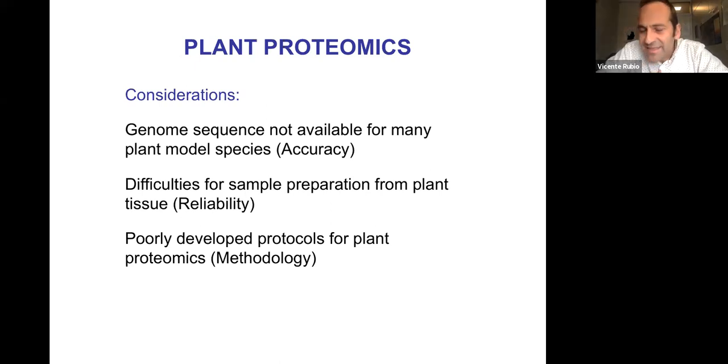So when we start working with a different model, we need to set up again many steps in the purification or processing protocols. The methodology needs to be updated depending on the plant species. But fortunately, many protocols are already available for different plant species that we can apply, particularly for Arabidopsis.